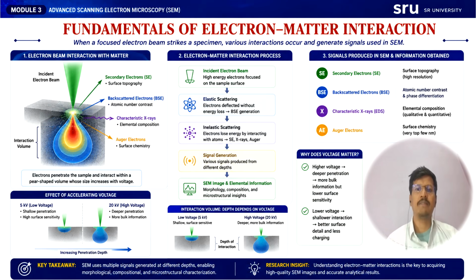So understanding electron matter interaction is essential because every SEM image and every elemental analysis result originates from these interactions.